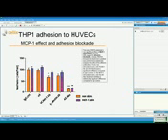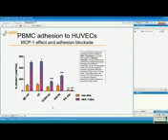As you can see, the stimulation of THP1 has no effect on cell adhesion, but the antibodies have effect. And in fact, if you use both antibodies, we get the highest decrease of adhesion, up to 10% of cells per field of view.